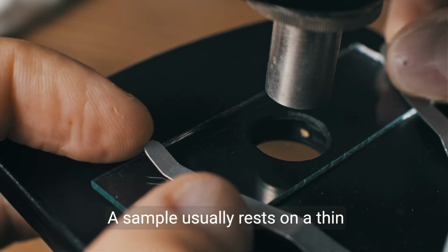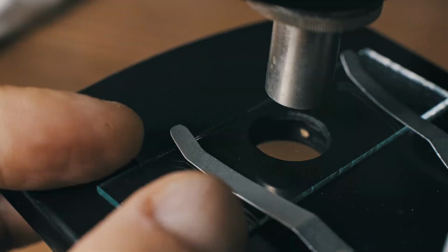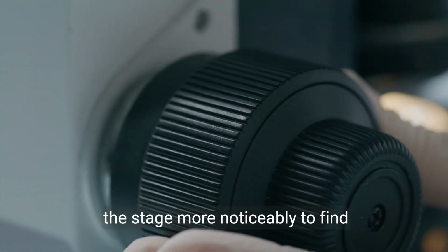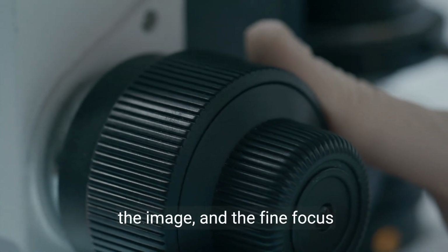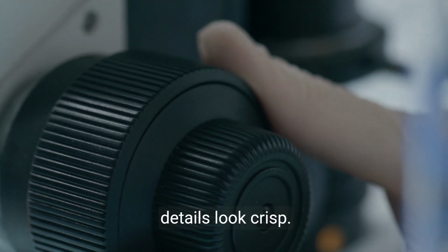A sample usually rests on a thin glass slide, held on the stage with clips. The coarse focus knob can move the stage more noticeably to find the image, and the fine focus knob makes tiny adjustments until details look crisp.